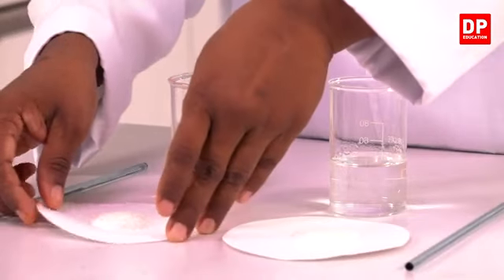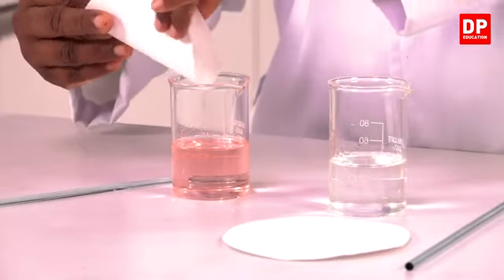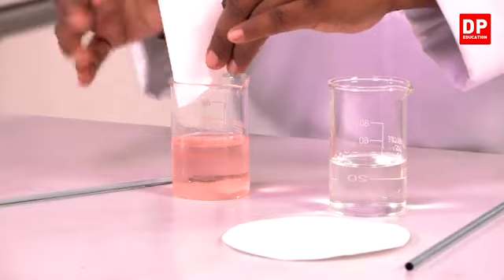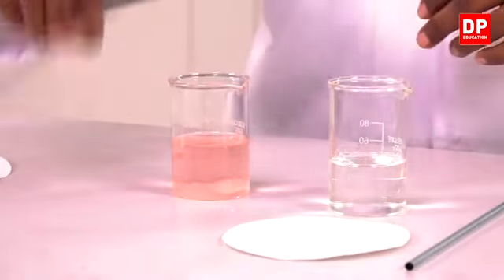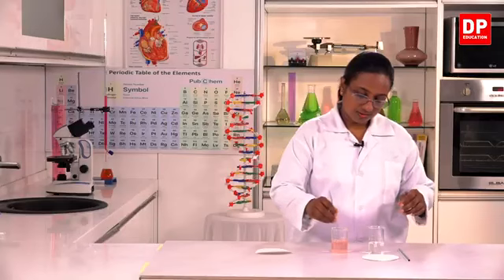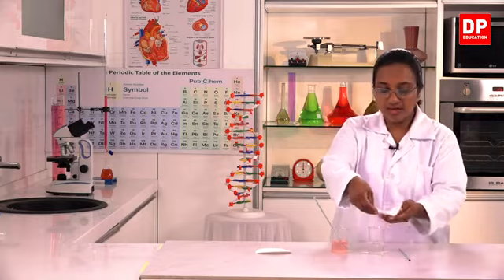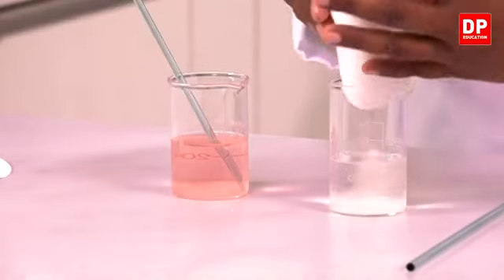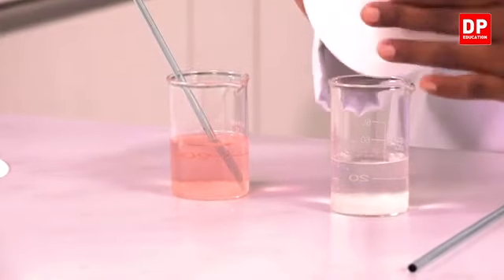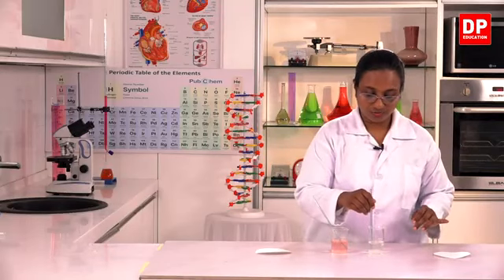So to the first solvent, I will add the 5 grams of sugar. Completely we have to add it and I have to dissolve it. At the same time, I will add the 5 grams of sugar into water as well. And I will try to dissolve that also.